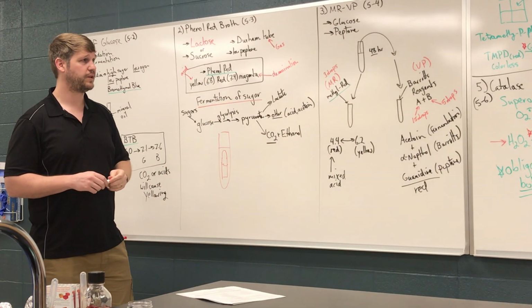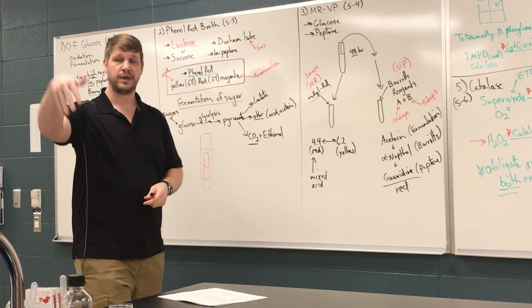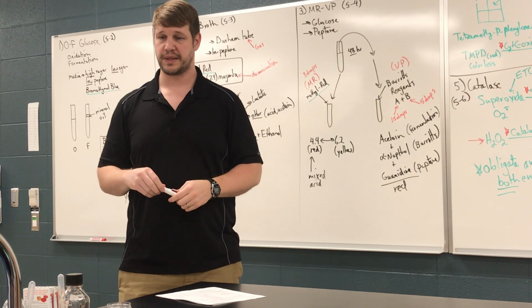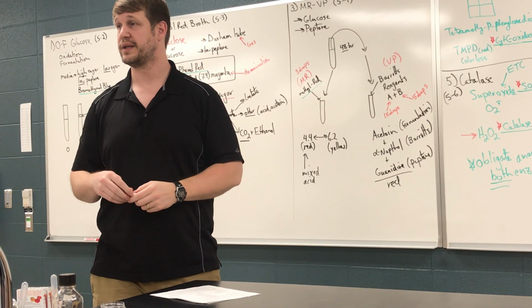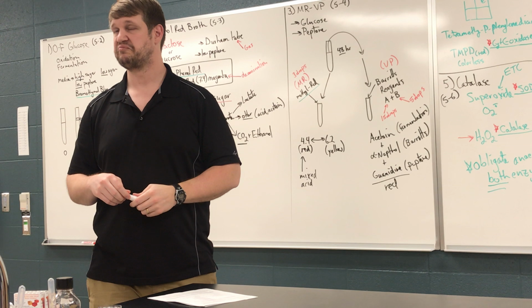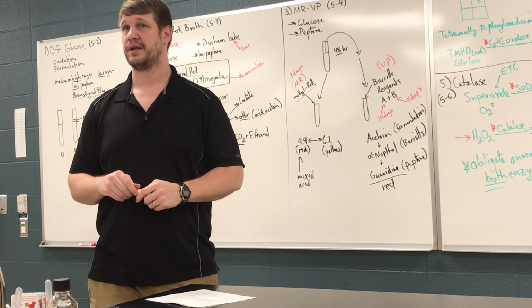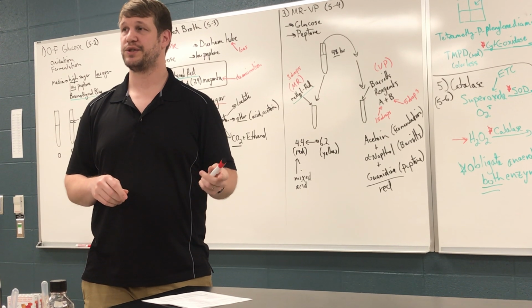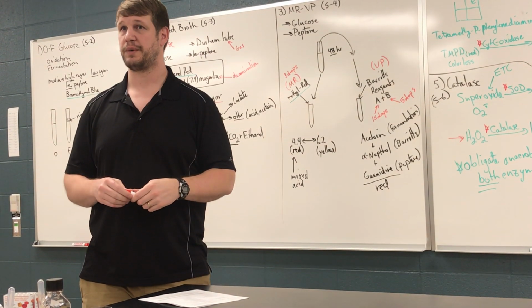Inoculating these won't take you long. Don't forget to also inoculate new stocks to carry forward. There's nutrient broths there for you to do that too. Yes? Are our stocks from two weeks ago still okay to use? Yeah, they should be. They're not going to be terribly healthy, but there should be enough viable microbes in there to get your new ones up and running.